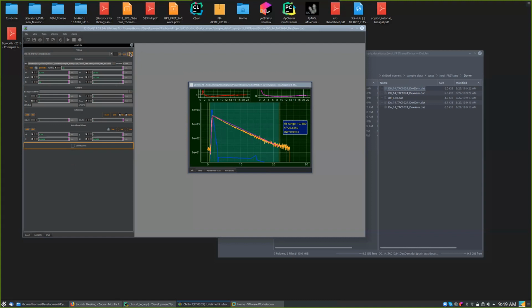Now here on the top right, on this button, you can click to estimate errors. Then it will do a Monte Carlo sampling run and estimate the errors of the 3 parameters. I didn't mention that the first is the fixed parameter.